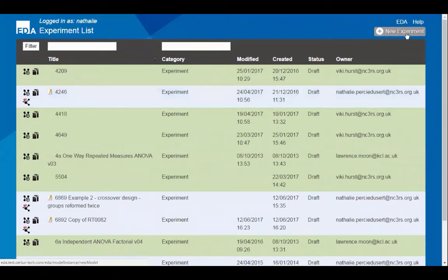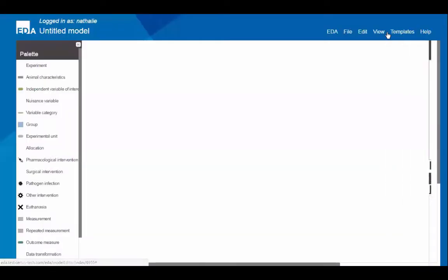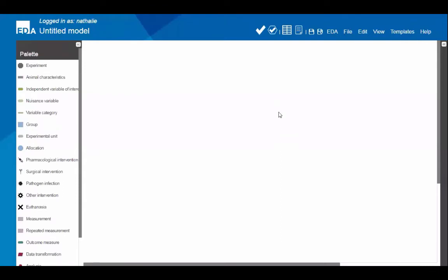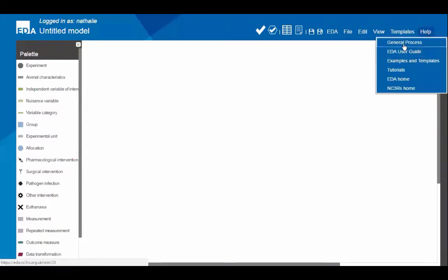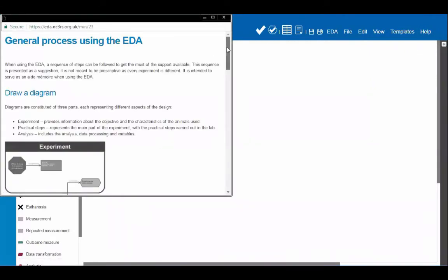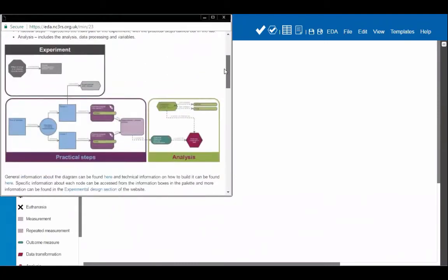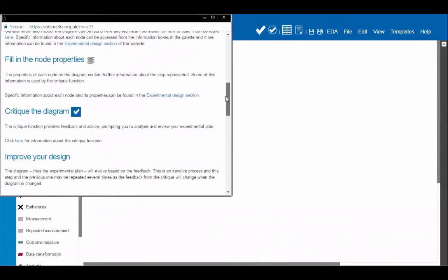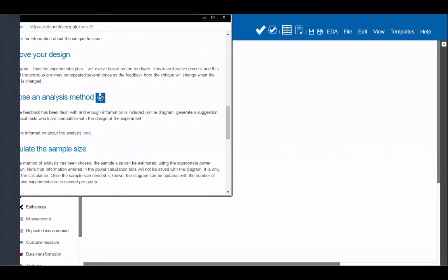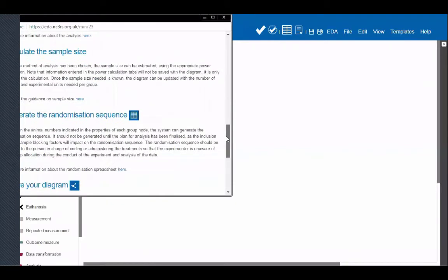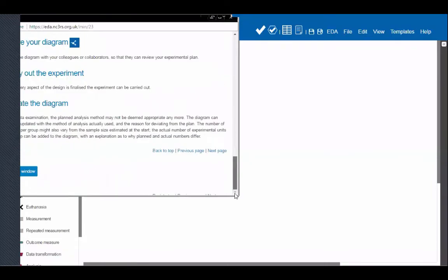I'm going to create a new experiment. You click the 'New Experiment' button in the top right corner, and that takes you to the canvas where you design your diagram. I'll start by showing the help menu, where you find information about the general process — a useful reminder of the steps when using the EDA. So you need to start drawing a diagram, add detail in node properties, critique your diagram to get feedback, choose an analysis method, calculate your sample size, and generate your randomisation sequence.